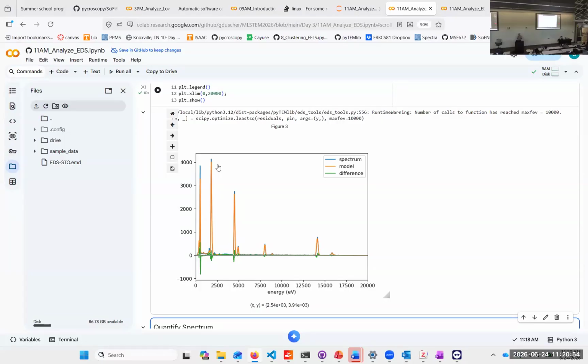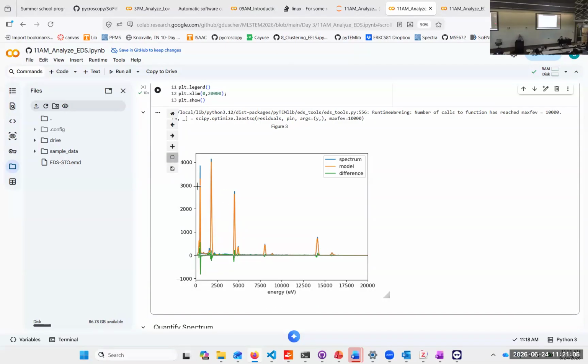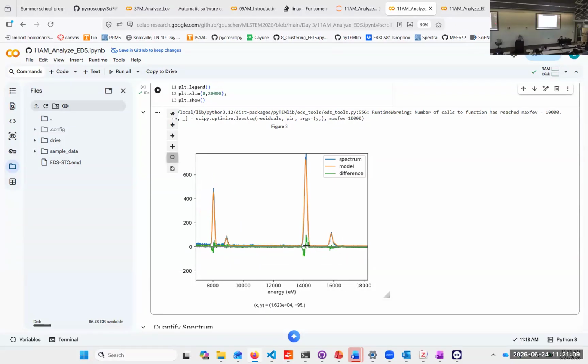Others fit a peak into it. That's a little bit better because it requires a flat background. And as I said, I fit my background on there. Let's see how good the fit is. We'll zoom in a little bit. You notice that I do not do anything with my peaks.